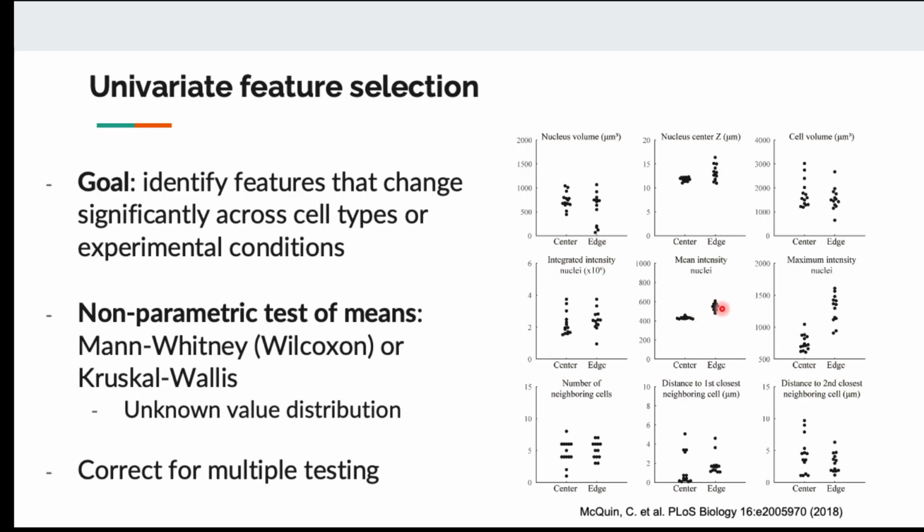You have an image from the untreated condition, and you have an image from the treated condition. You have the shape, area, intensity, and texture measurements from both conditions. Now you can compare whether those numbers differ across the conditions.